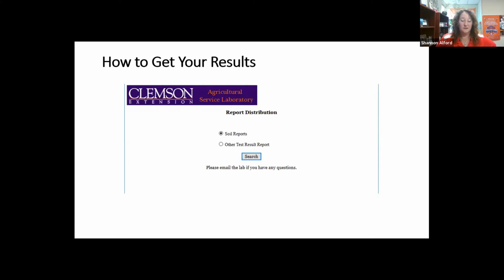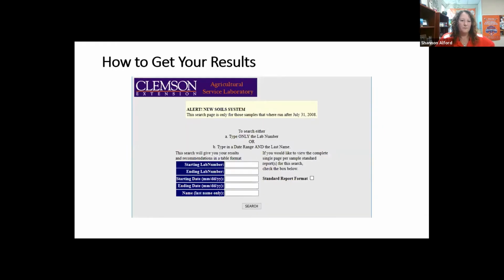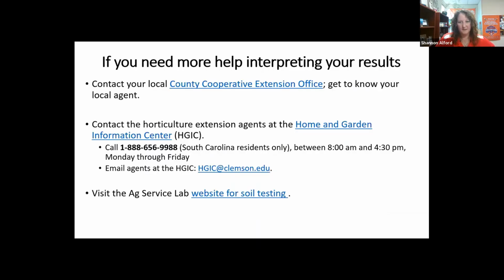If you had sent us water or plant tissue or something else, you can also see those results on this website. There are some different search features. We're trying to update that, so you have even more search options, but hopefully you would be able to find your results under your name pretty easily using the current search features on our website. And that's just for looking at your results, whether soil or anything else.